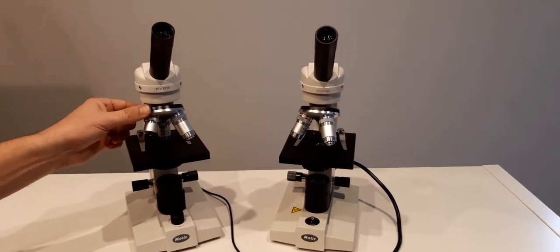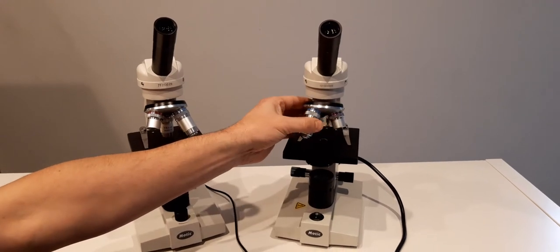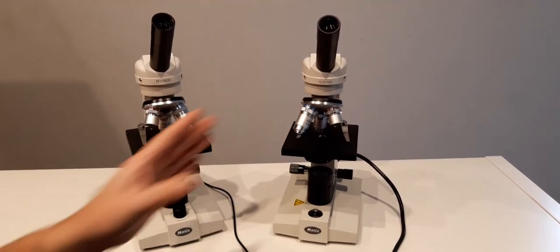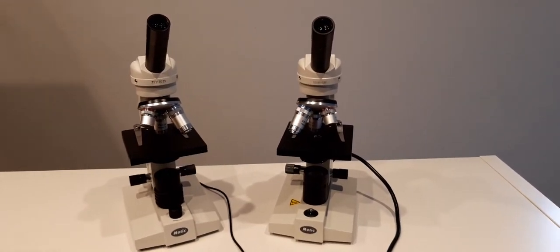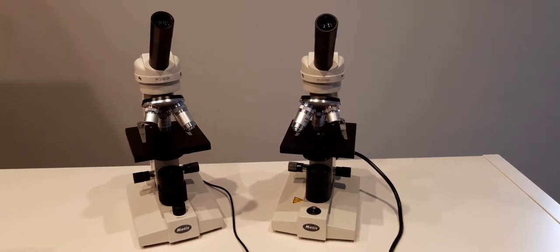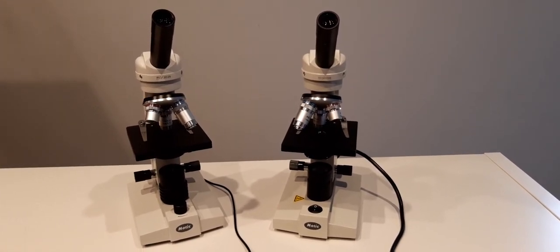Moving down we see again both contain a triple nose piece. These have a 4x 0.1, 10x 0.25 and 40x 0.65 achromatic lenses.